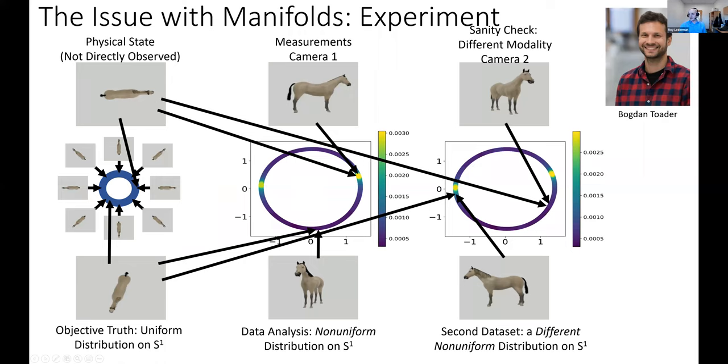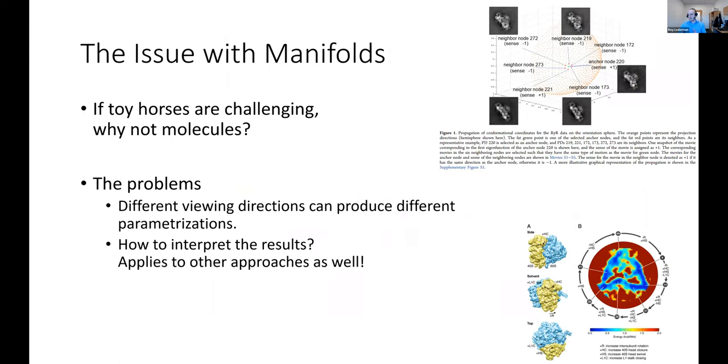In practice, for example, if you look at the molecule from different directions and it's flipping around and doing something, you would get a different metric, a different manifold. It's difficult to stitch. So that's one of the issues with this. There are a lot of other questions about these methods. They addressed a lot of them, but there are fundamental issues. I'll circle back to this at the end. It's not specific to manifold learning methods. It's sort of hidden in other methods as well.